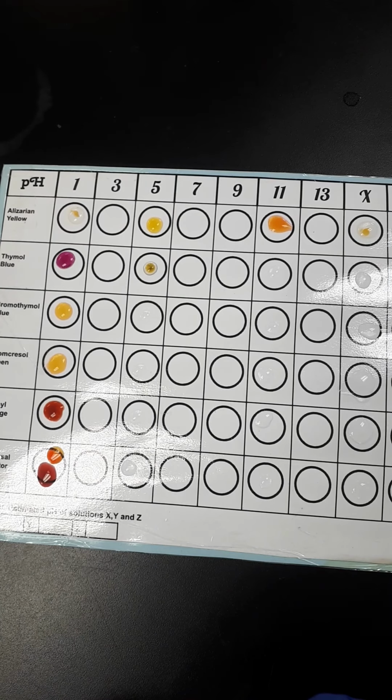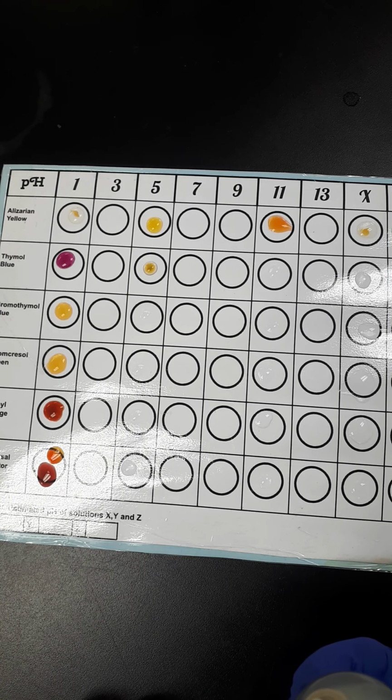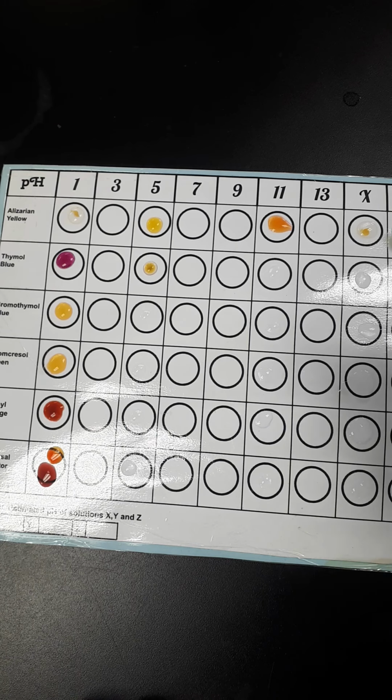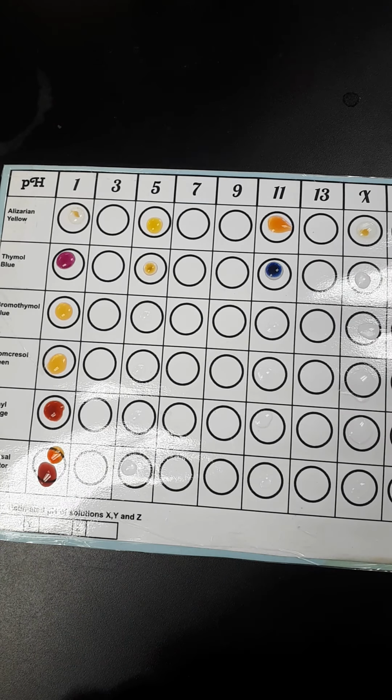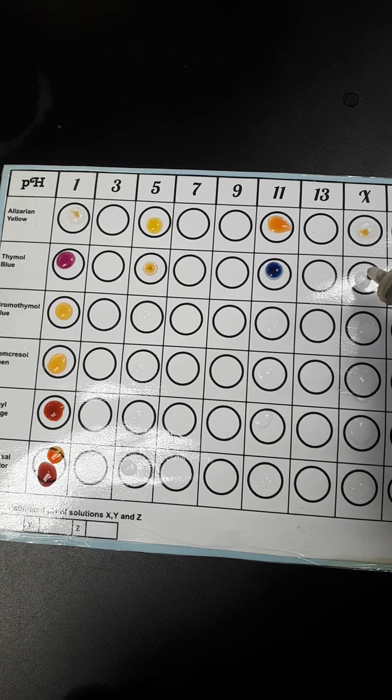There we go, and turning yellow. Very nice. In a pH of 11, we should be blue. Very, very nice. And then in our unknown, let's see.